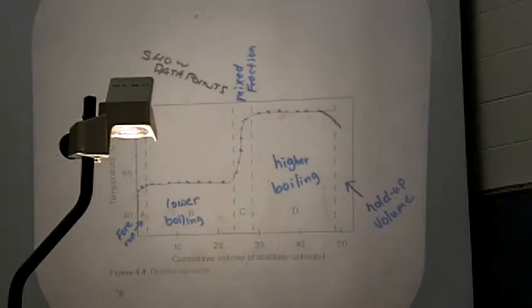So you want to keep adding more and more heat till you've got a nice distillation going. Then you're probably going to have a little bit of a drop, or maybe just a rise in temperature. Then you want to up the Ohmite setting more, get a nice steady distillation going, okay? So you want 2 nice steady distillations, and you have to be vigilant on your Ohmite, but not go crazy, okay?